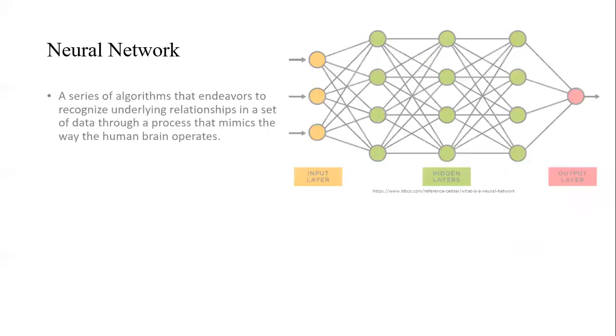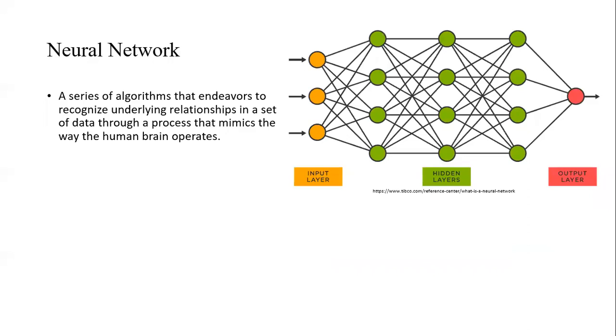In this project, a neural network was created based off LIBS. A neural network is a computer architecture that processes data in a similar way to a brain. It uses neurons in a layered structure that resembles the brain. It does this through machine learning. The inputs in the neural network are the spectra, which are a continuum of color formed when a beam of white light is dispersed so that its component wavelengths are arranged in order. And our outputs are the compositions of the sample.